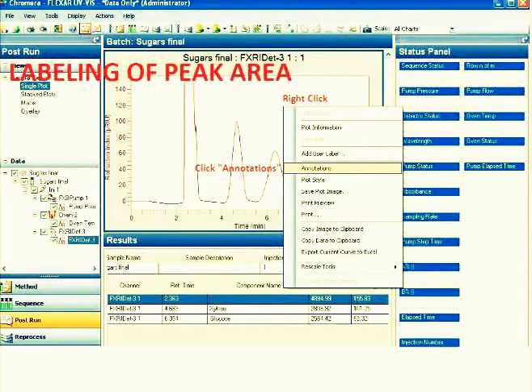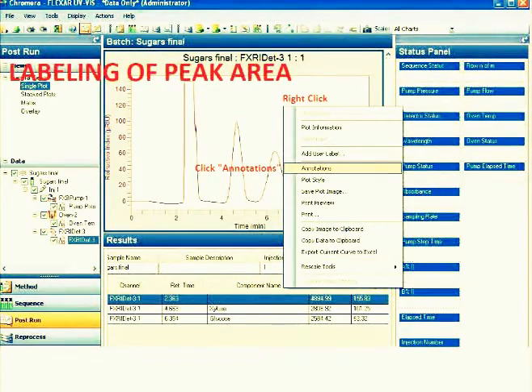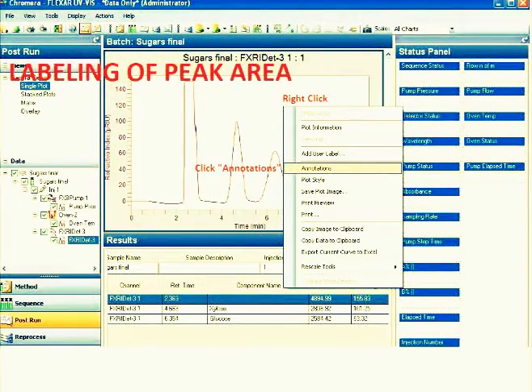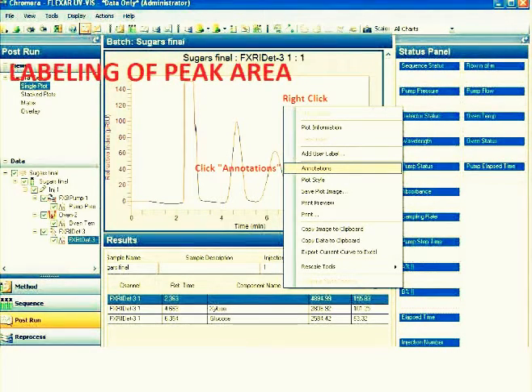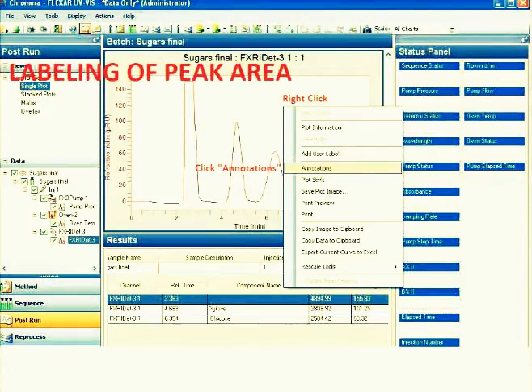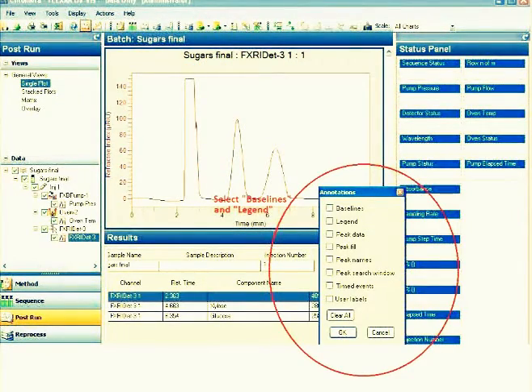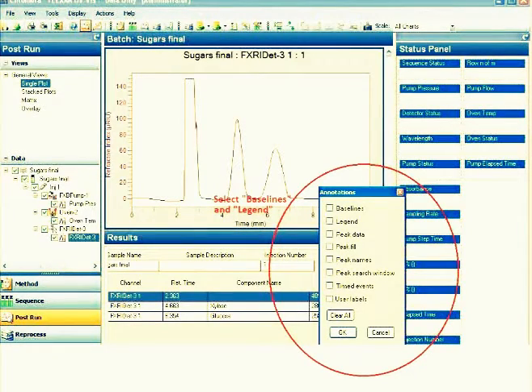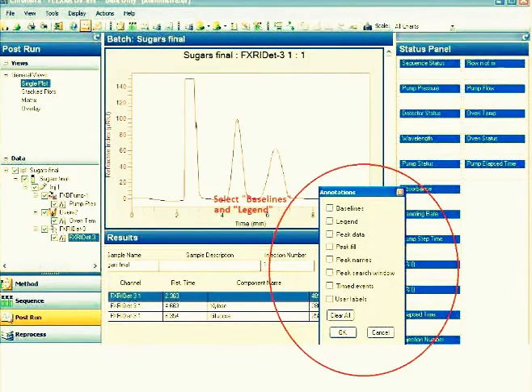Next is for the labeling of the peak area. This is a sample of labeled data. Right click, then click Annotations. Here you will see the baselines, legend, peak data, peak fill, peak names, peak search with no time events, and user labels.